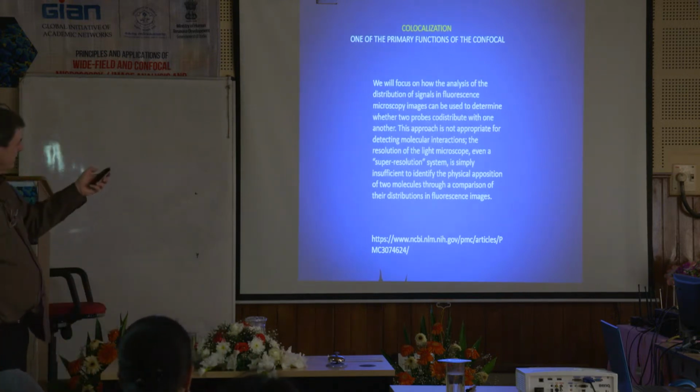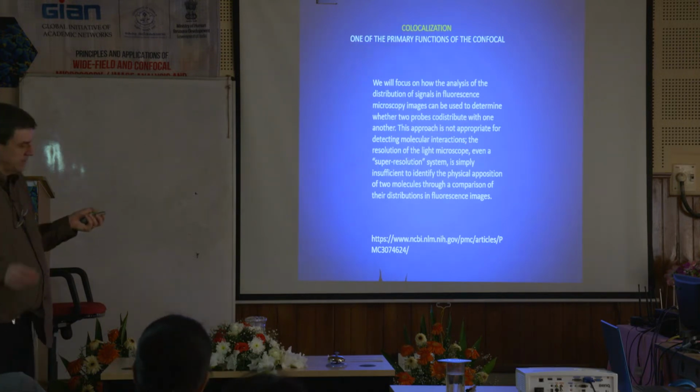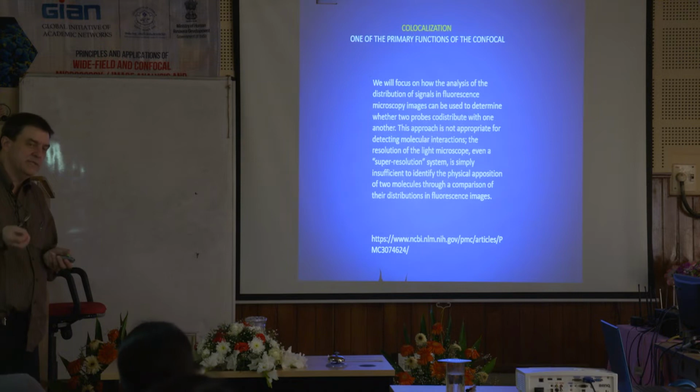The one thing to keep in mind is I think people overestimate the power of this. This approach is not appropriate for detecting molecular interactions, even in a super resolution system. Just because 2 proteins co-localize doesn't mean those 2 proteins are working together.